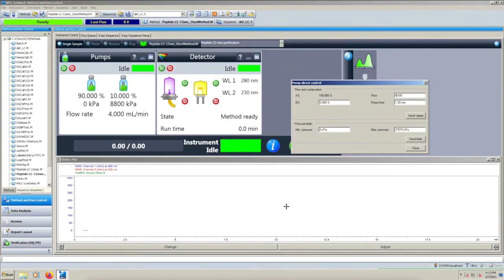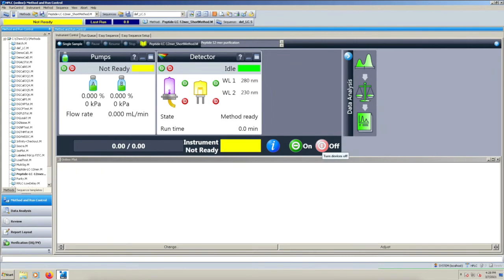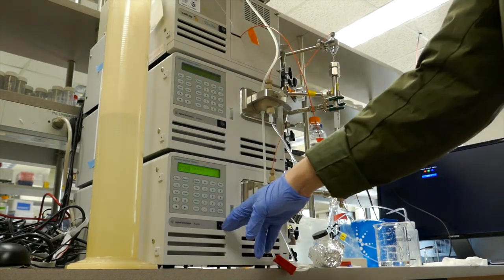After the run is complete, we're going to ramp down the system in the reverse of what we did before. Then press the off button to turn off all of the pumps, and then flip the switches on all the pumps to power them down.